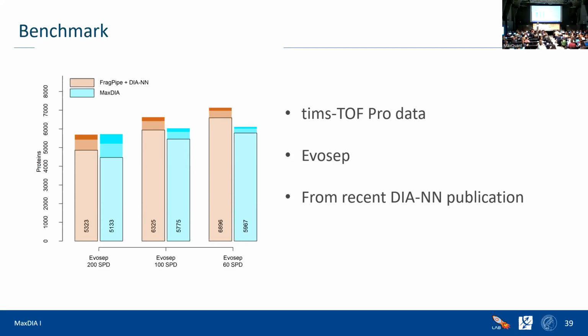Thank you, Jürgen. In the MaxDIA world, the retention time alignment that we used to experience in the DDA world is completely different, right? If you're using a discovery library that has been created in silico and compare it to your LCMS runs, there is no such thing as matching retention time. What you do is create a kind of curve from the experimental data matches. Is that how it works?